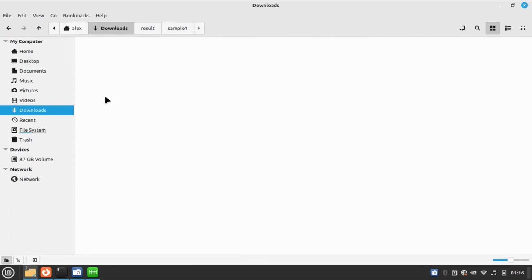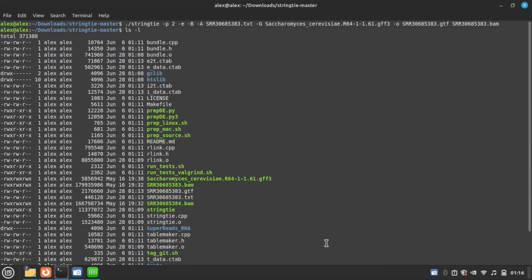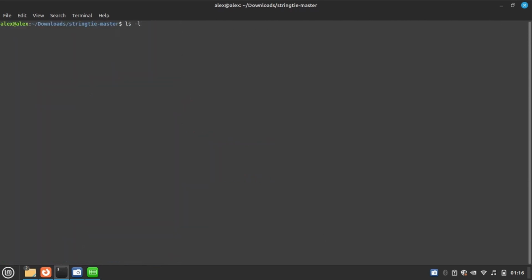Okay, so let's do it for the second sample. So I am just changing the 84 file, this one, and there is 84, and all is fine, and enter.